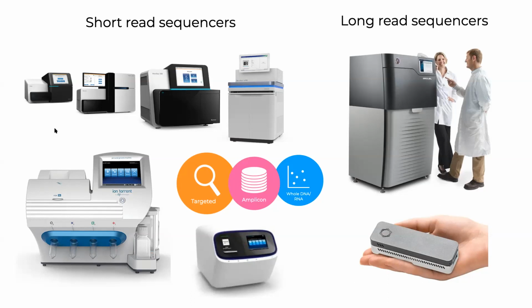So if we talk about Illumina sequencing, the process goes the following way. We have genomic DNA, and again, if this is RNA, that is converted to cDNA. We cut the material up into very short pieces, then add adapters to create a sequencing library, apply it to a flow cell, then amplify the genetic material through bridge PCR amplification, and then comes the sequencing part, which again looks like this.